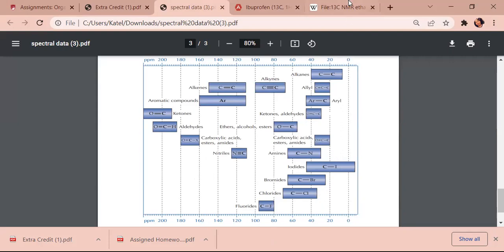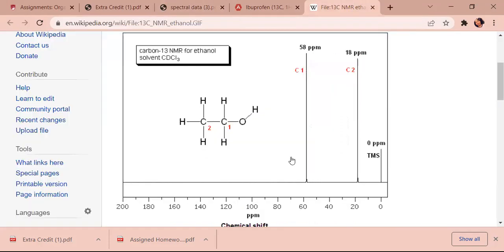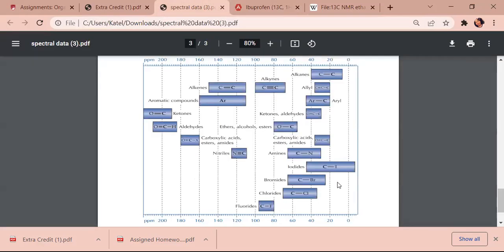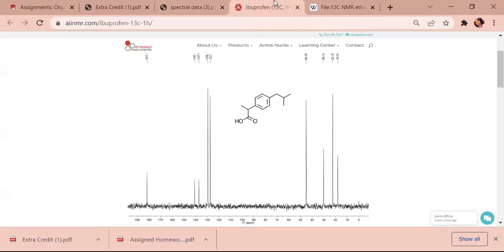So this structure right here, it could, I keep opening the wrong one. It could signify this guy right here, so it could be a signal from one of these two that's showing this carbon is attached to this carbon, which is attached to this double bond. We have one around the 20 mark. So I'm going to say the only real one I see over here is that carbon on carbon.